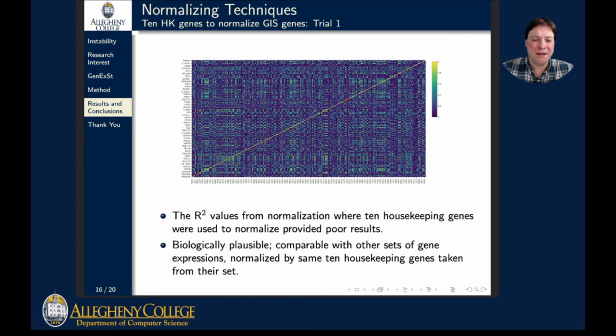in biology. The values which are close to 1, or the colors in these heat maps which are close to yellow, suggest correlations. Each of those correlations still has to be verified in a biological setting, but these are more realistic to what we would expect to find in nature.